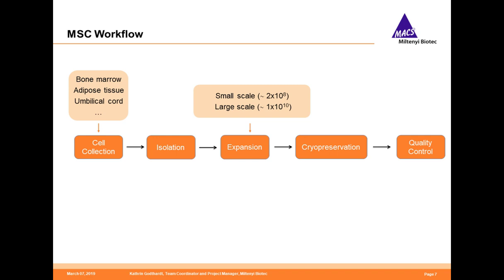So on the one hand, of course, small-scale research applications are used, and also a lot of small-scale clinical applications, when you think about autologous settings, or large-scale expansions for any kind of allogeneic clinical settings. After expansion, in most cases, cells are cryopreserved and quality controlled.